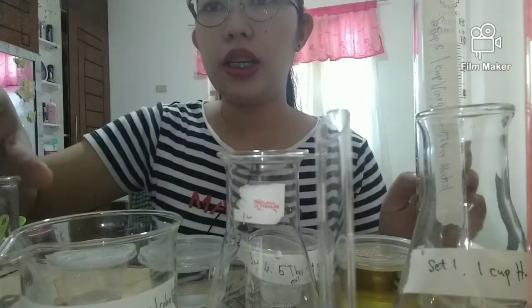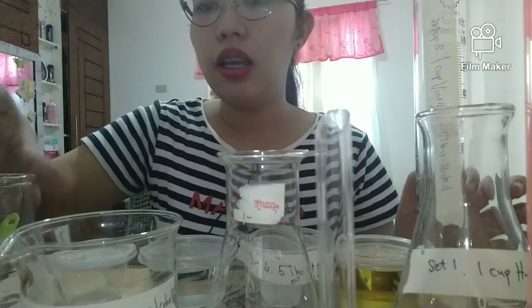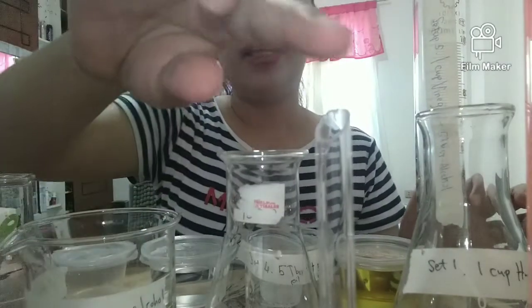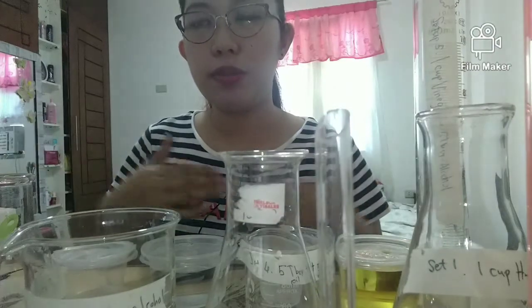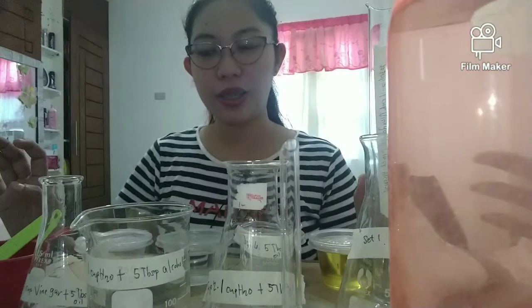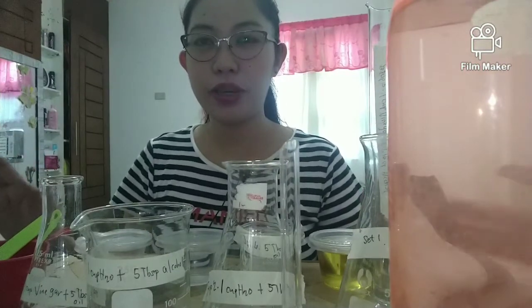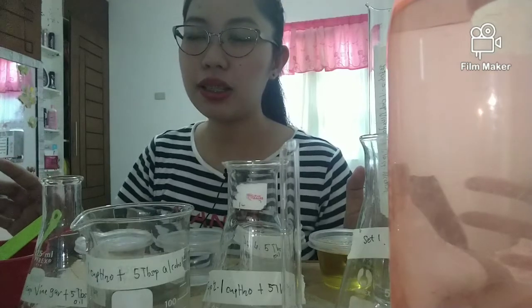I also prepared an Erlenmeyer flask, a beaker, a funnel, and a graduated cylinder. Because I didn't have disposable cups, I used my remaining laboratory equipment to conduct this experiment.